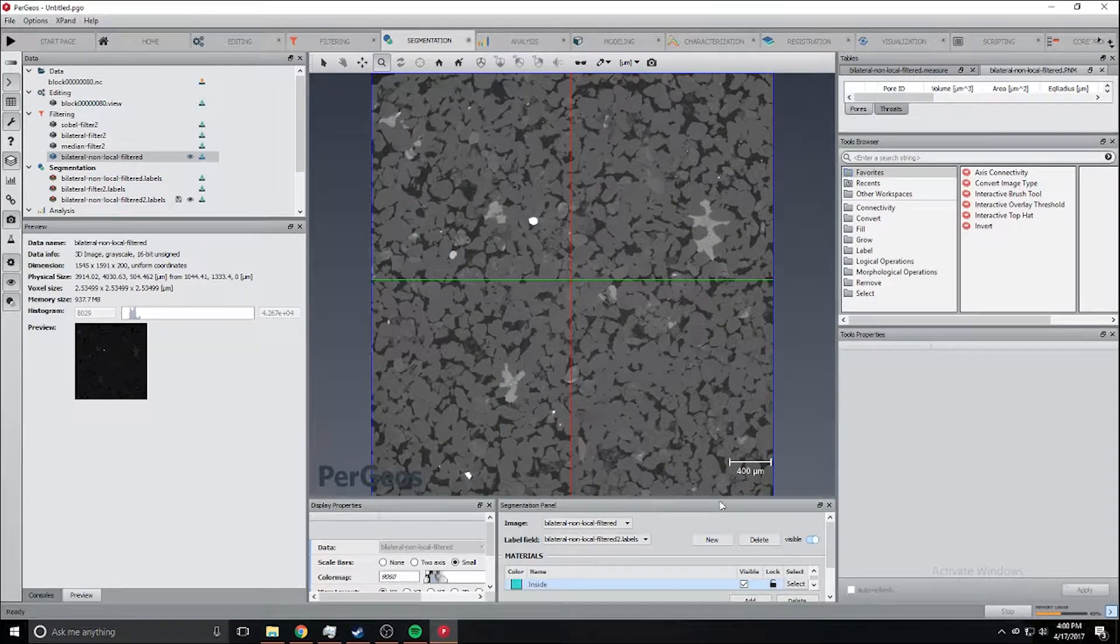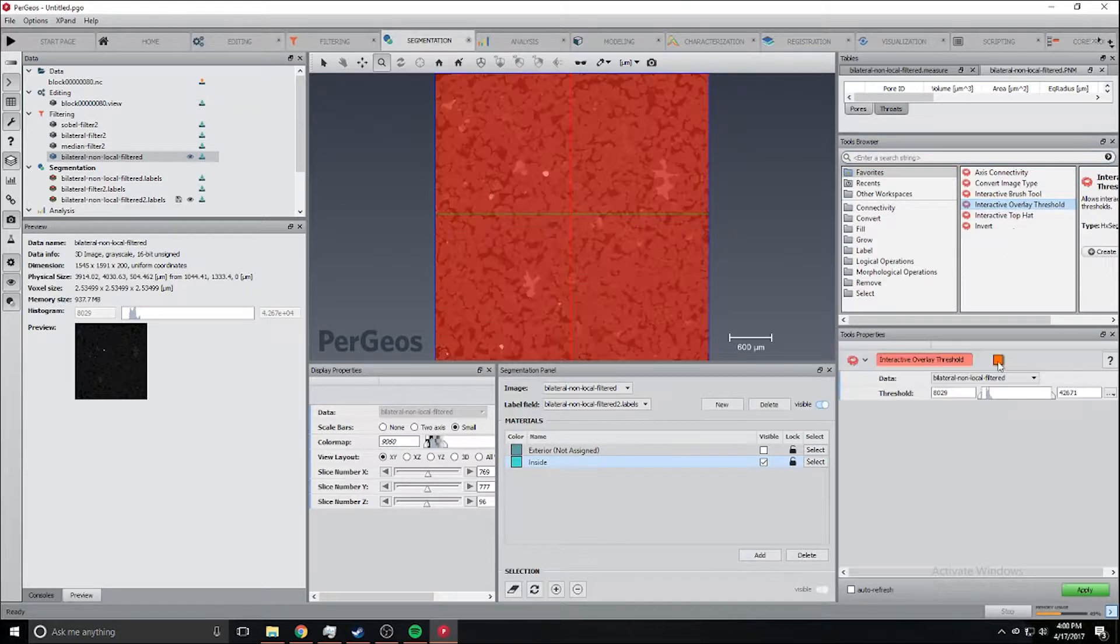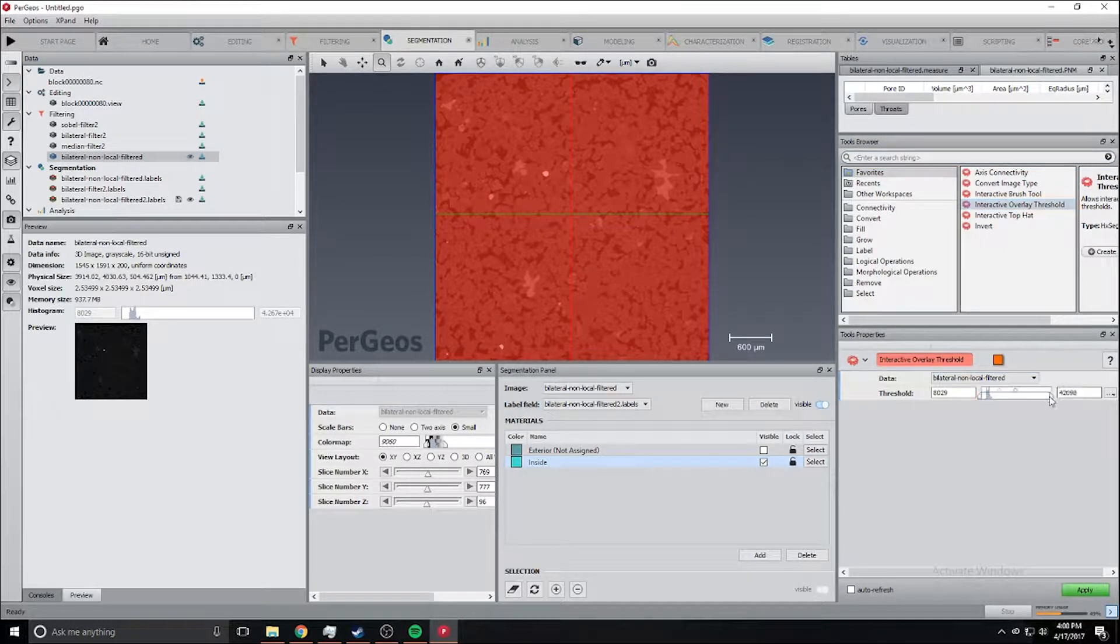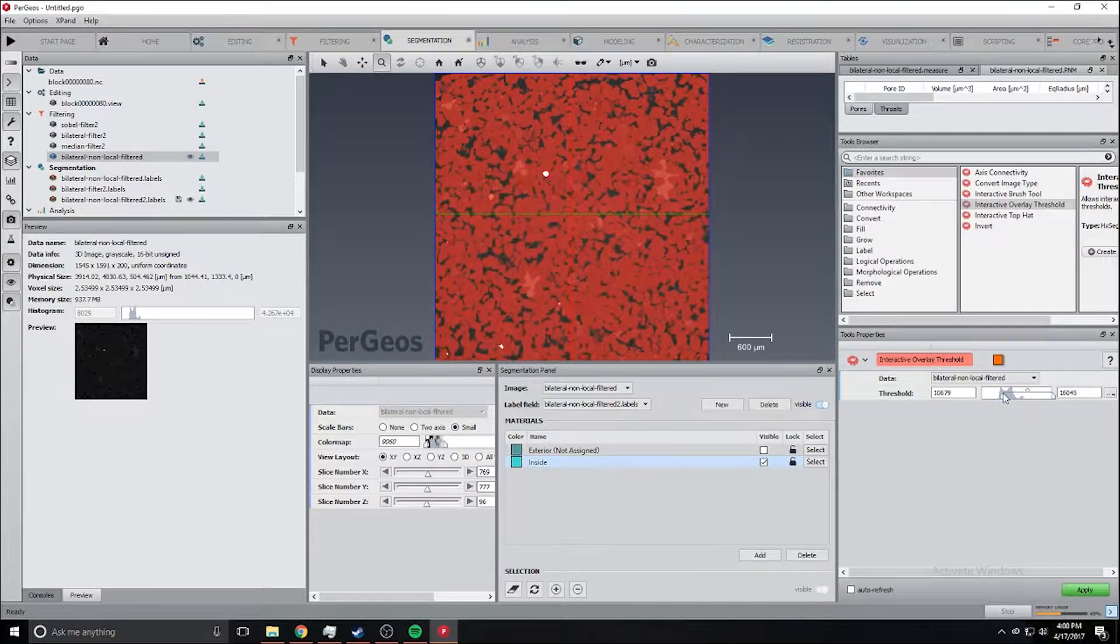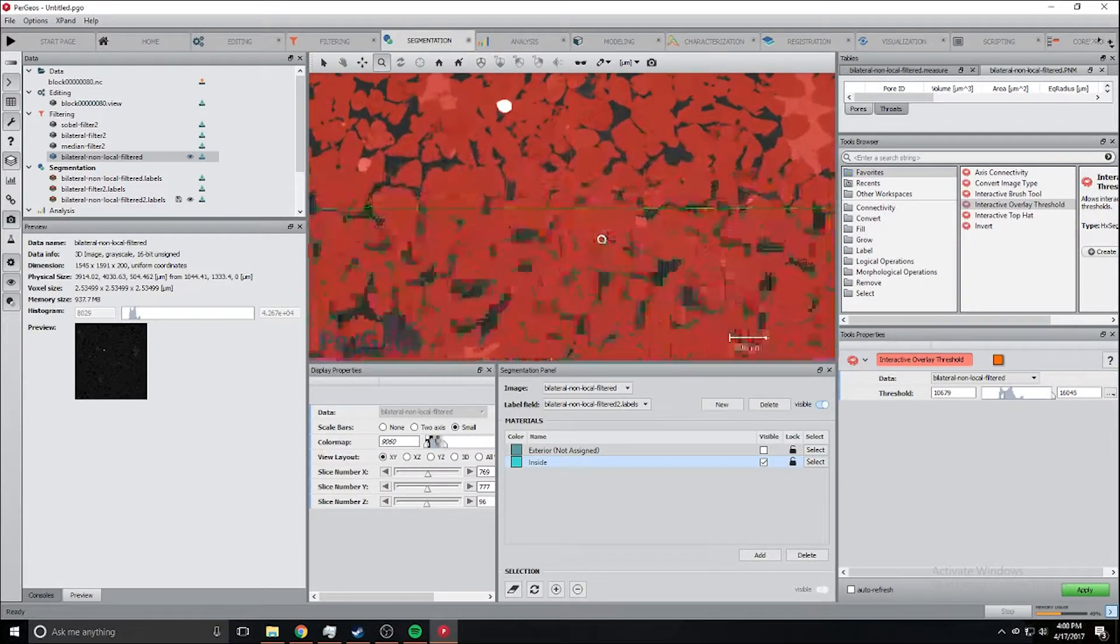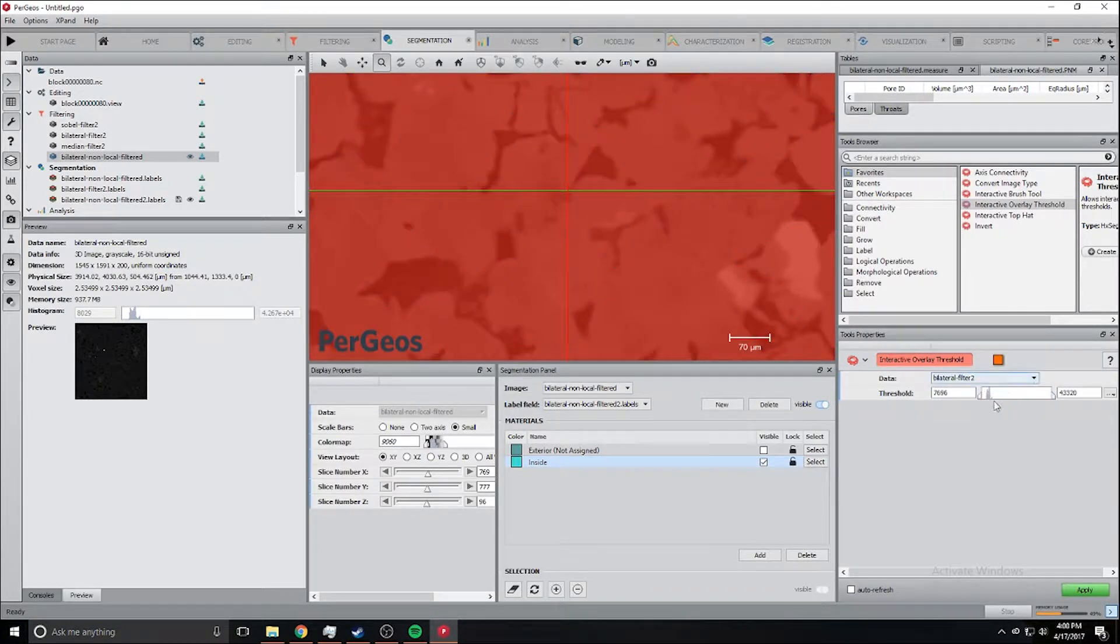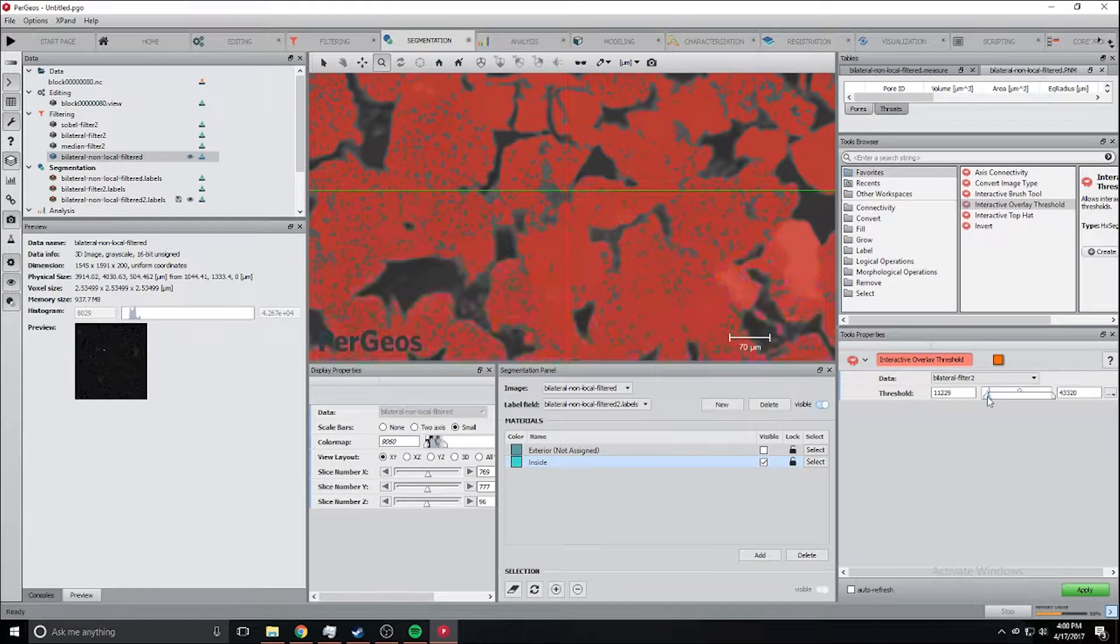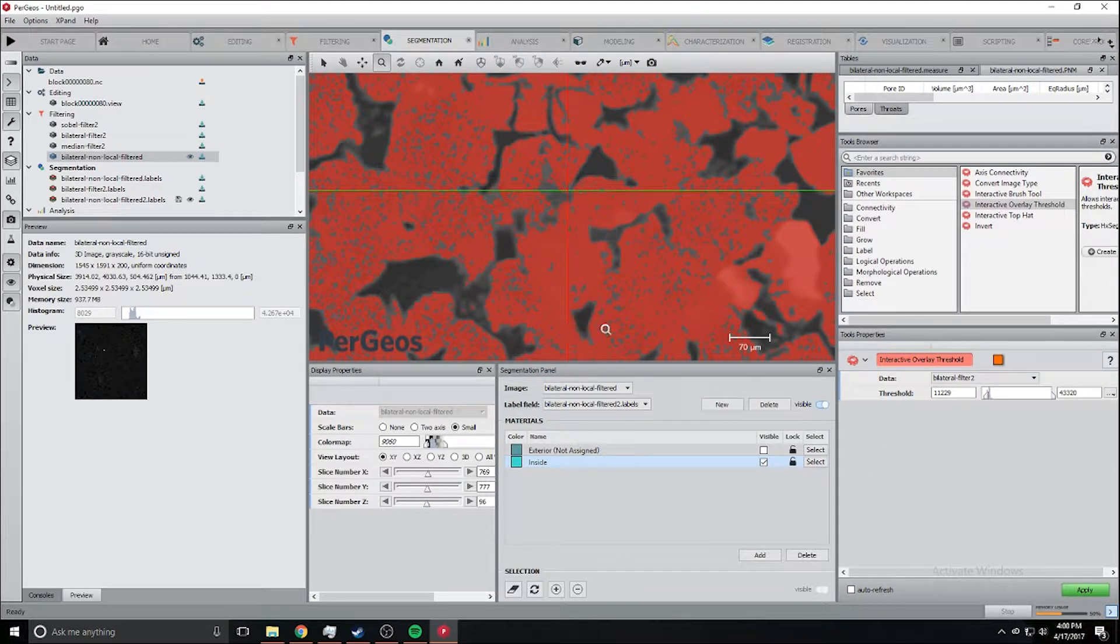We're going to start out very simple with an interactive overlay threshold. Zoom to range, let's zoom in a bit more and try to decide how much to do. That actually looks pretty good, especially if we use the fill holes method.